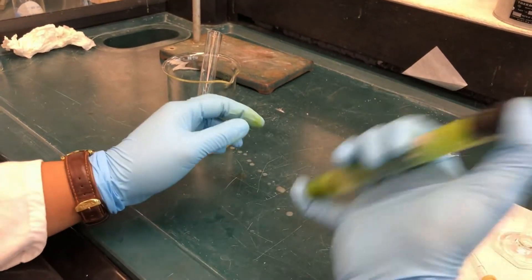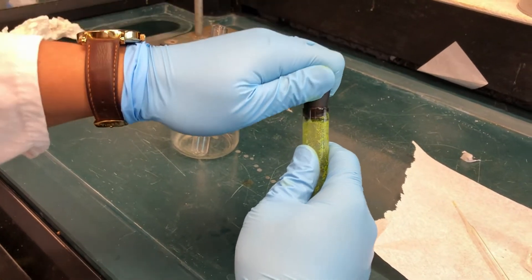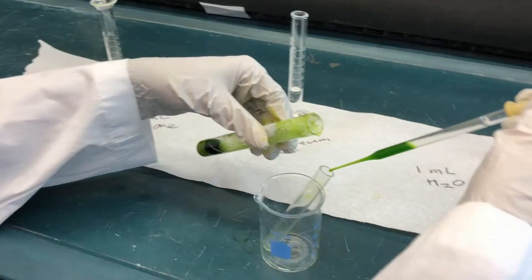Shake for 5 minutes. Be sure to hold your thumb over the stopper so that it can't pop out. Remove the stopper occasionally to remove pressure inside the test tube.